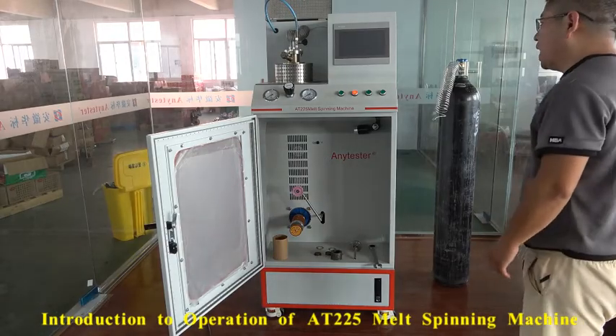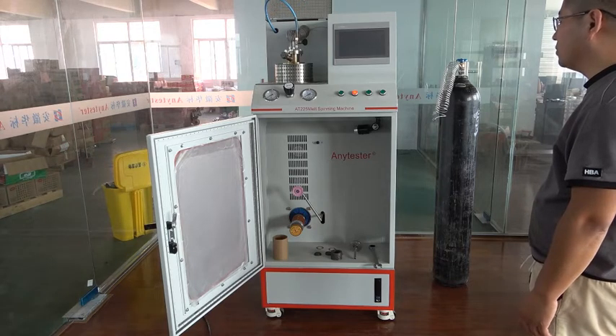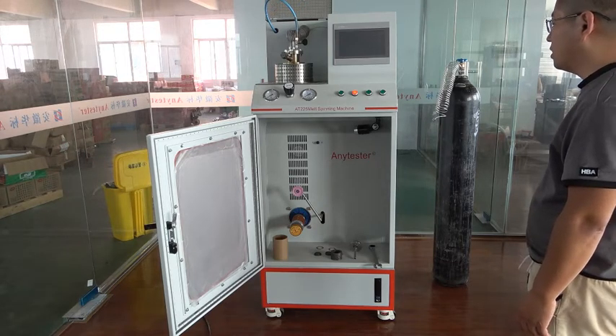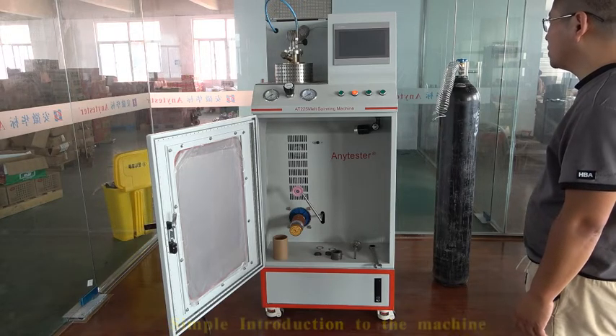Now, I will show you how to operate the AT225 melt spinning machine from Anytester. Before I operate the machine, I will make a simple introduction to this machine.